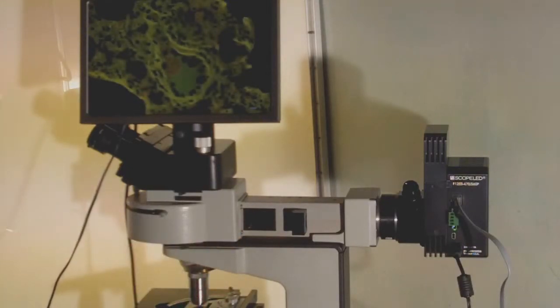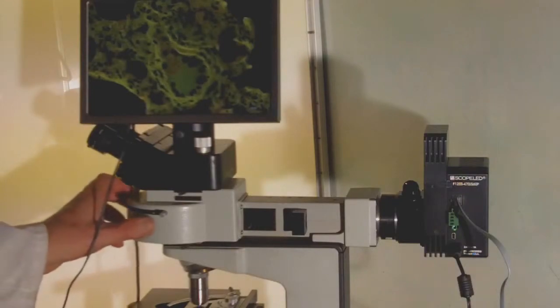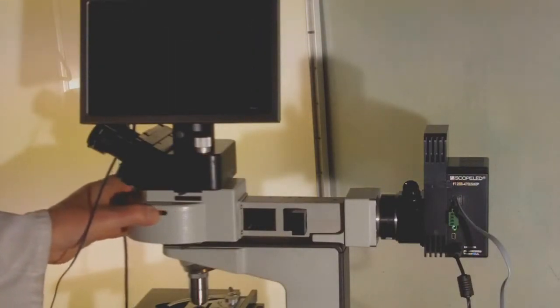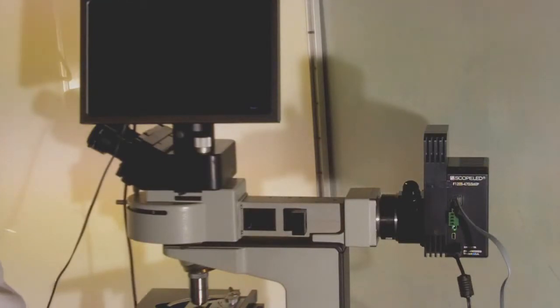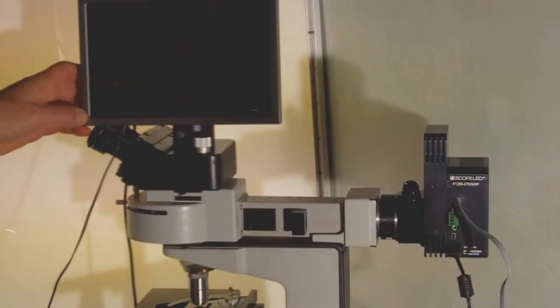This is just a standard 25x dry objective looking at some lung tissue that's been thin sectioned. To go to the secondary wavelength, the green light excitation, we can quickly switch.